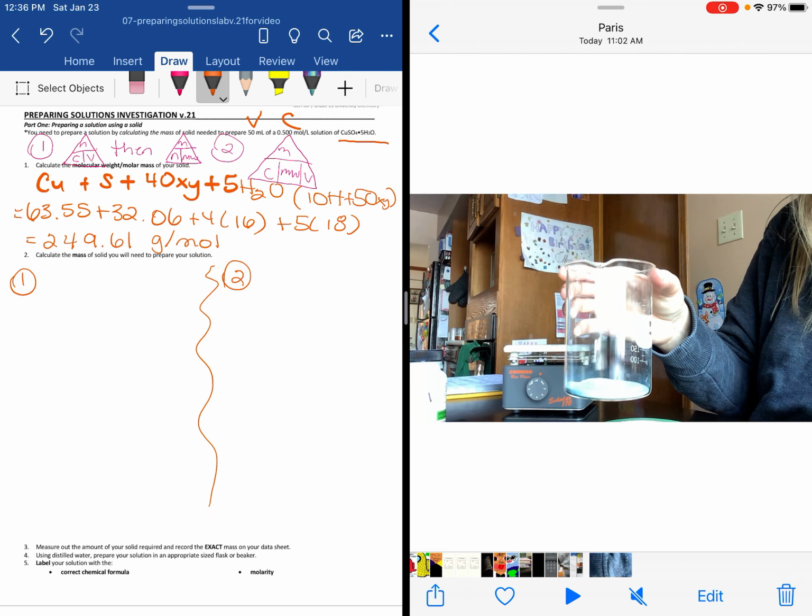What you're going to see is that we're going to get the same answer, obviously, and it really just is personal preference. Okay, so when you have concentration, the concentration up here is moles per liter, so that means that our volume is liters. So right now we are given the volume as 50, and in order to get to liters, it's milliliters divided by 1,000.